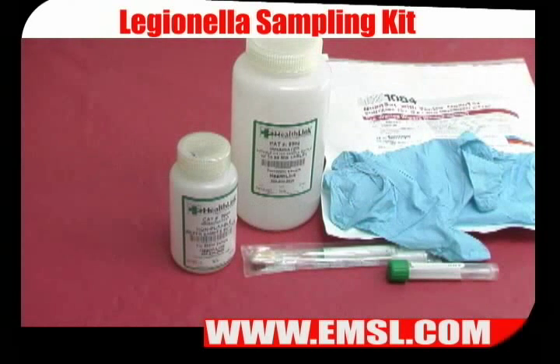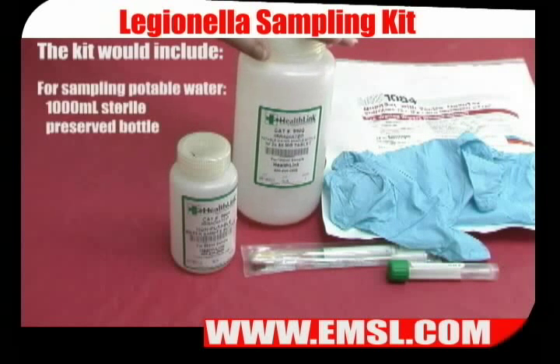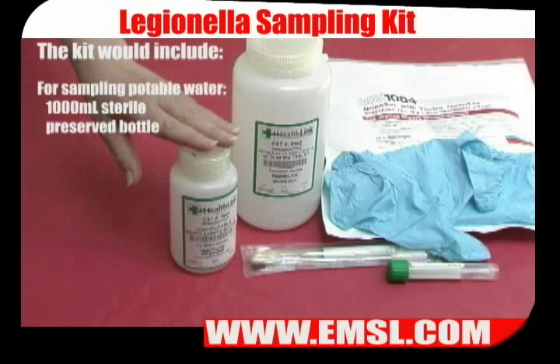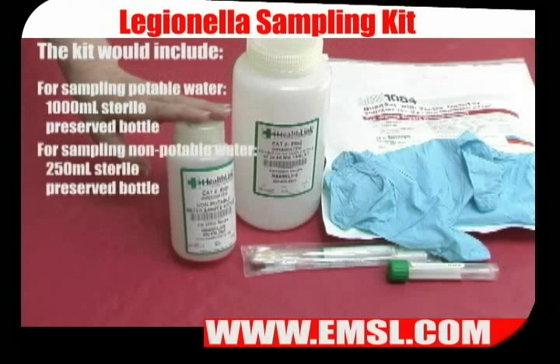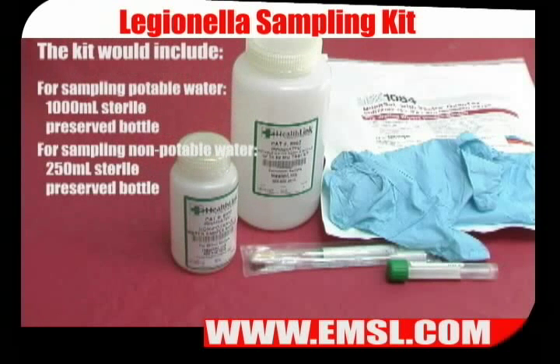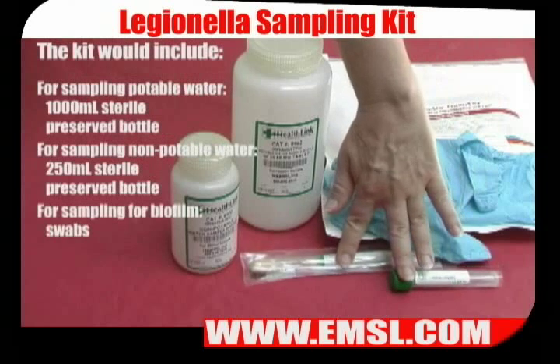When you get ready to sample, you can call the laboratory and order the supplies that you need. If you're sampling for potable water, you'll need a 1,000 milliliter sterile preserved bottle. For non-potable water, you'll need a 250 milliliter sterile bottle. If you're sampling for biofilm — either in a faucet or in a cooling tower — you'll need swabs.